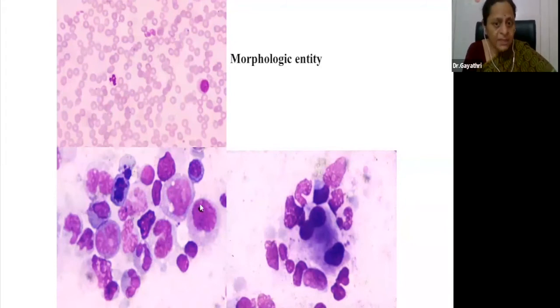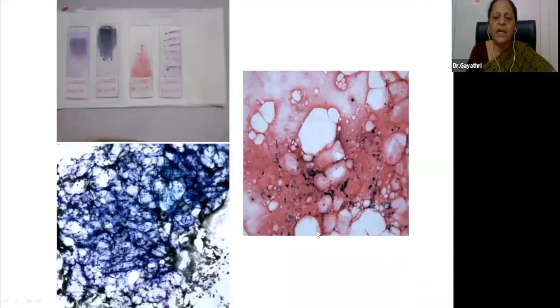This one is a blast. This one is probably a blast. These erythroid precursors are again showing features of dyspoiesis, nuclear budding, fragmentation, and so on. So we identified dysmyelopoiesis and dyserythropoiesis and blast prominence. And what do we see here in another frame of the same case? A megakaryocyte that's totally abnormal. So dysmyelopoiesis, dyserythropoiesis, dysmegakaryopoiesis. Classical triad for myelodysplastic syndrome.